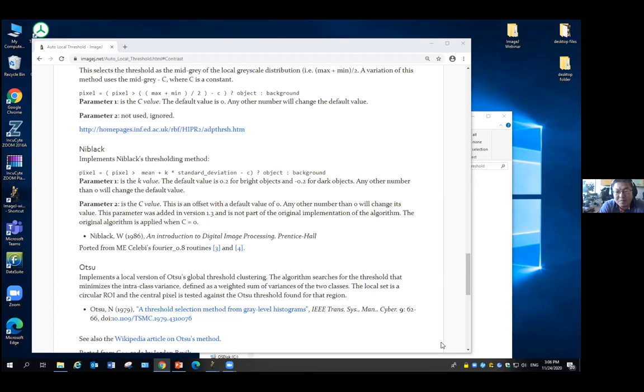Actually, I think it works much better. It saves you much of the trouble in the future on the image analysis. So always when you're working on an image, if something goes wrong and gives you trouble in the image analysis, the first thing to think is how can I do better on the image acquisition on the microscope side? How can I get a much nicer, less noisy image to input into ImageJ? I think that is very important.